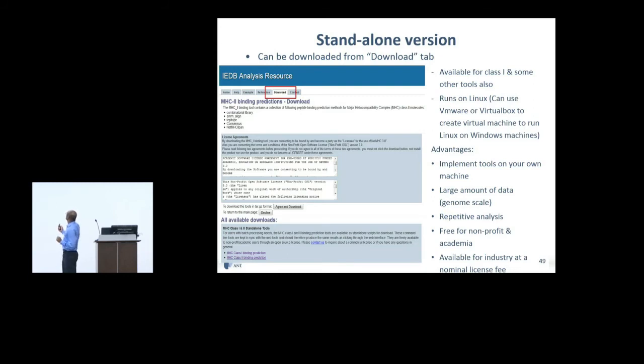And what are the advantages? You can implement the tool on your own machine, and you don't have to depend on an internet connection. And the major advantage is in case of a large amount of data. The online version, the web version, will not be able to handle a large amount of data. It's designed for only a small amount of data. And just now you must have seen, when a lot of people are working on the online version at the same time, it may slow down, sometimes it may crash. So the standalone tool, you can use at your own convenience, and you don't need your internet connection.